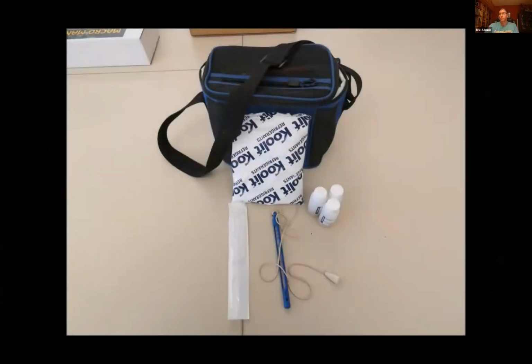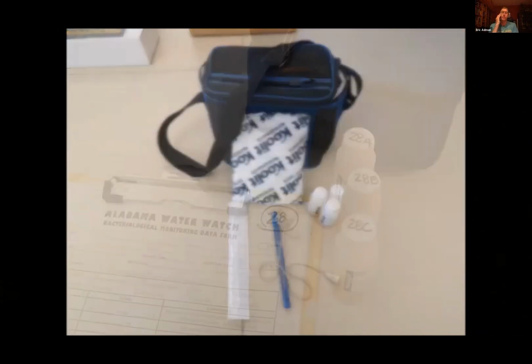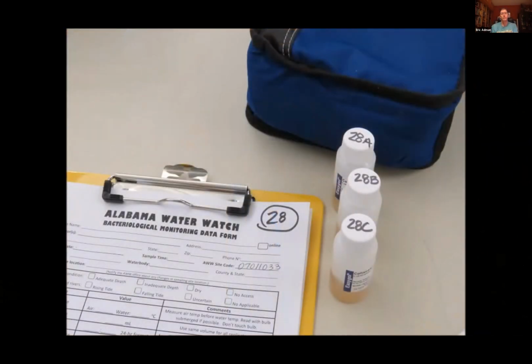For each site being tested, you will need a cooler with ice, 3 media bottles at air temperature, a sterile pipette, and a thermometer. Label your media bottles by site and replicate. If you sample multiple sites, be sure to use separate data sheets or keep record of monitoring site and bottle numbers that are grouped in sets of 3 replicates. For example, if you have 2 sites, you can number the replicates at the first site as 1A, 1B, and 1C, and the replicates at the second site as 2A, 2B, and 2C.